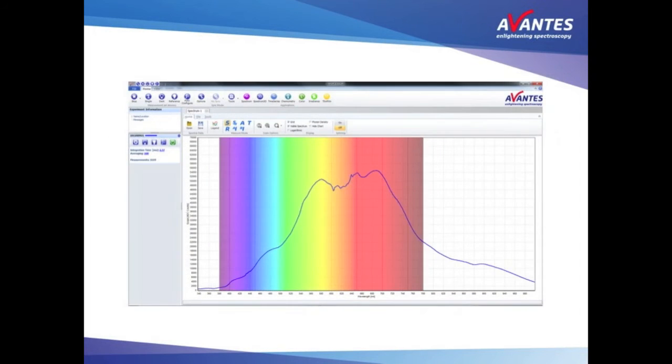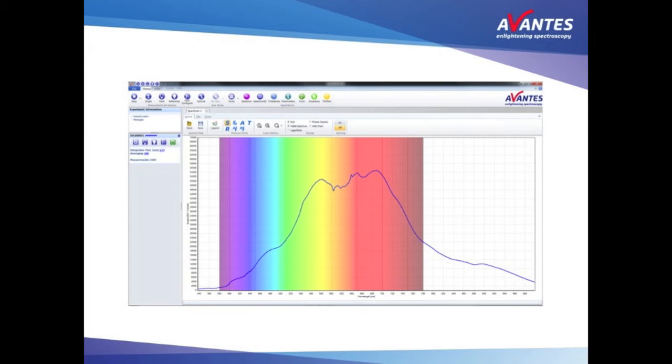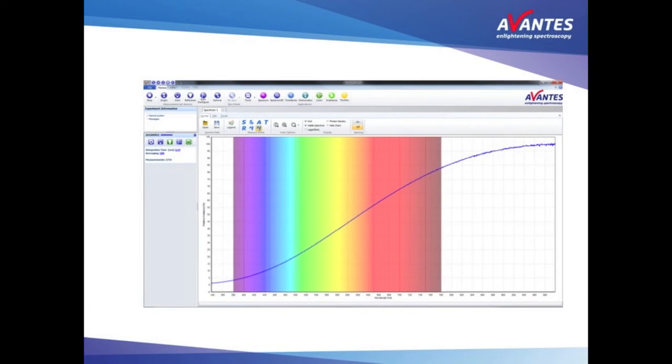To indicate the difference you now see a picture of the raw data of a broadband spectrometer looking at a halogen source. And on the next picture, what the spectrum should actually look like.